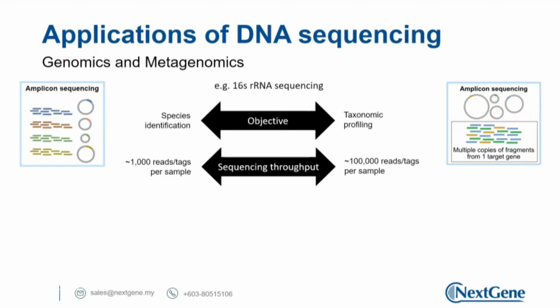The difference comes in when we perform the sequencing for these 2 applications. For normal amplicon sequencing of pure isolates, we do not really need to sequence a lot. I think the most common way is to extract the genomic DNA and then do PCR to amplify our target markers.